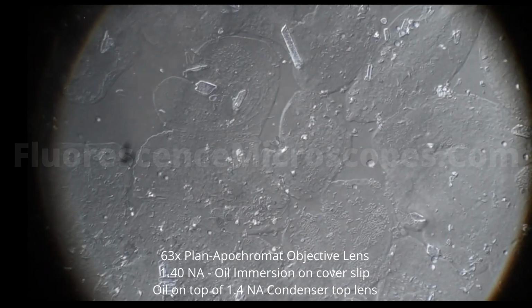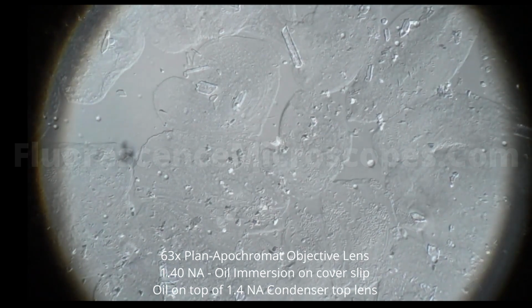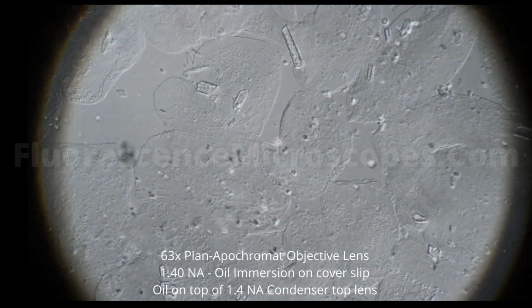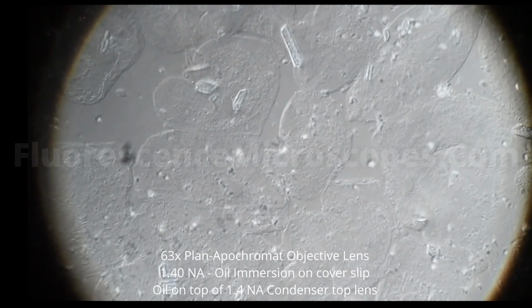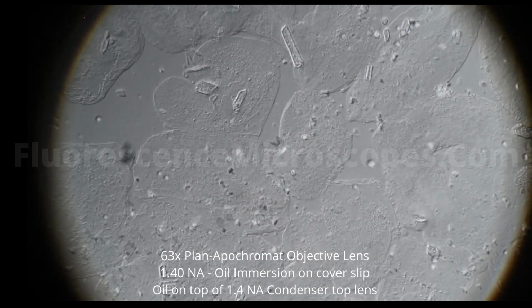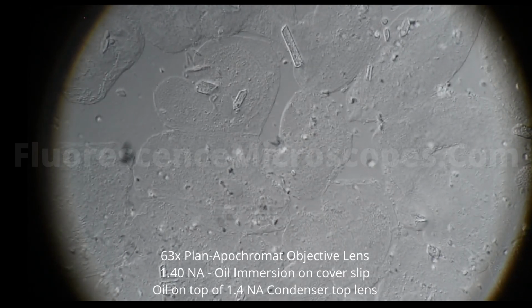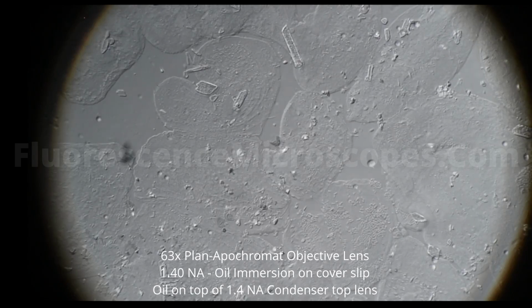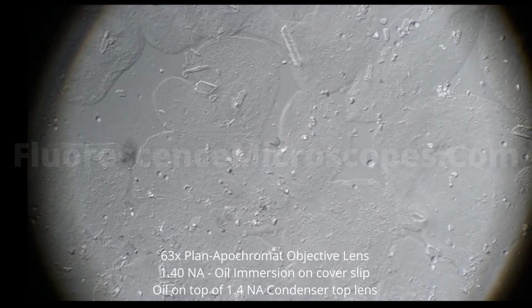And I'm going to adjust the shear plane. Going through a pseudo dark field, going through some negative bias. Adjust it back. Now I'm getting a positive bias in here. And I'm going to do just a few more adjustments to see what happens.